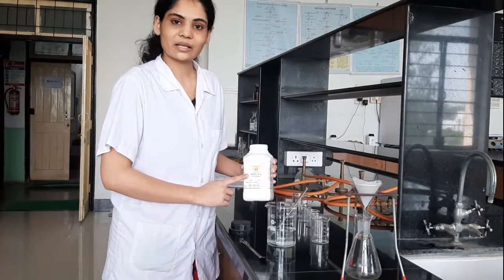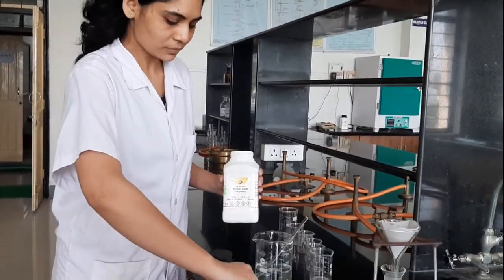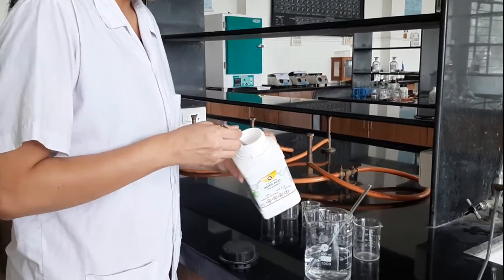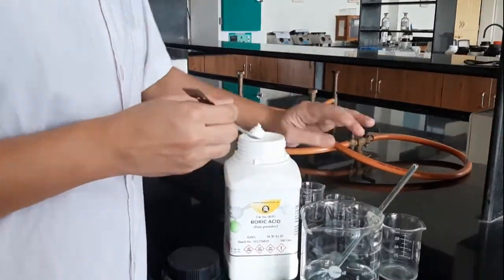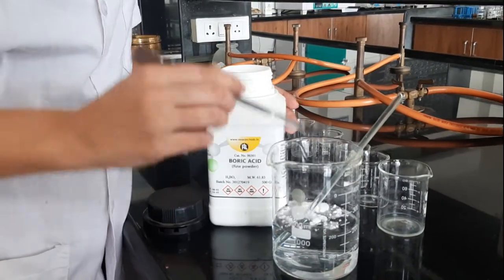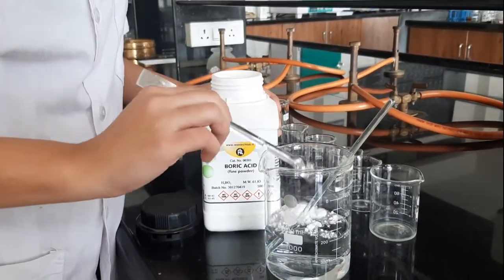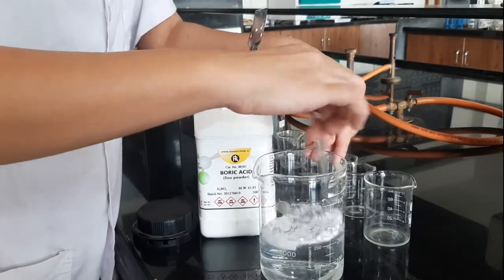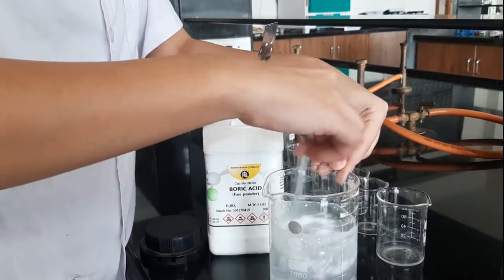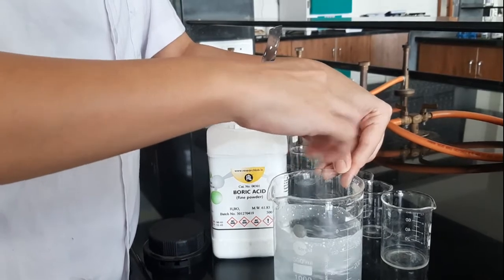We have taken this boric acid, and we will add some amount of boric acid directly into this previously measured 200 ml of water. We will dissolve this boric acid until we get a supersaturated solution.